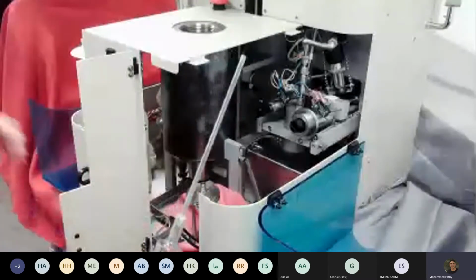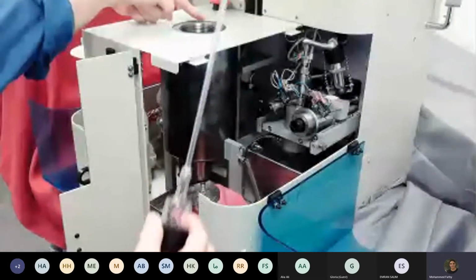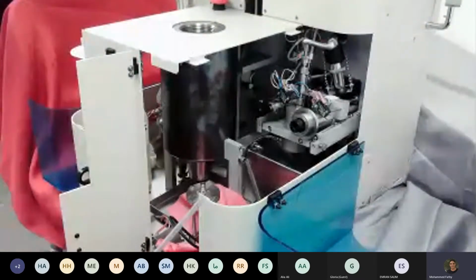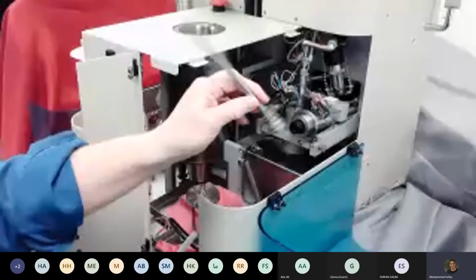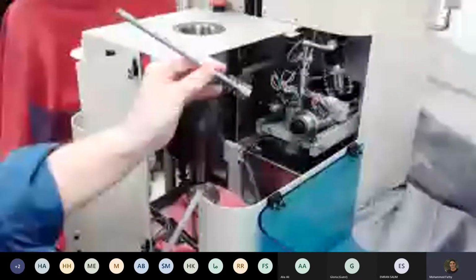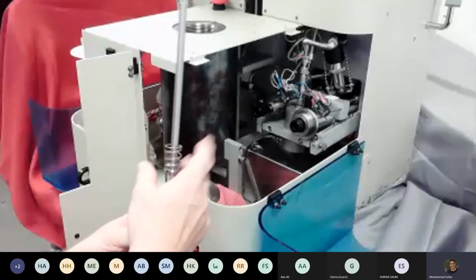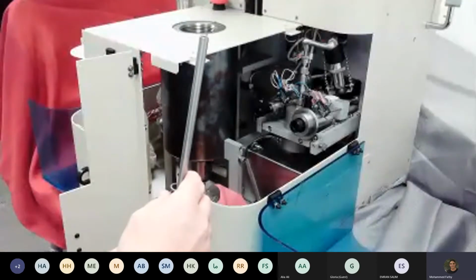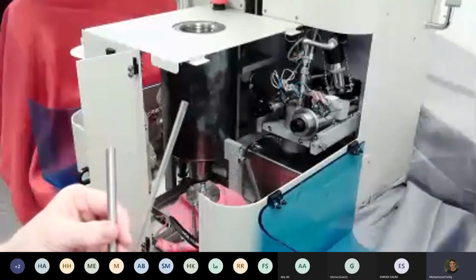And then after the low pressure run, the sample cell is going to go into the high pressure, which is this cavity up here. I'm pointing over here. And I'll show you here. This is how we make the capacitance measurements in the high pressure system with this removable sheath. We call this a metal sheath. It's a metal tube. It goes over the sample cell and allows the instrument in the high pressure system to measure the mercury intrusion. The low pressure sheath is built into the low pressure station.